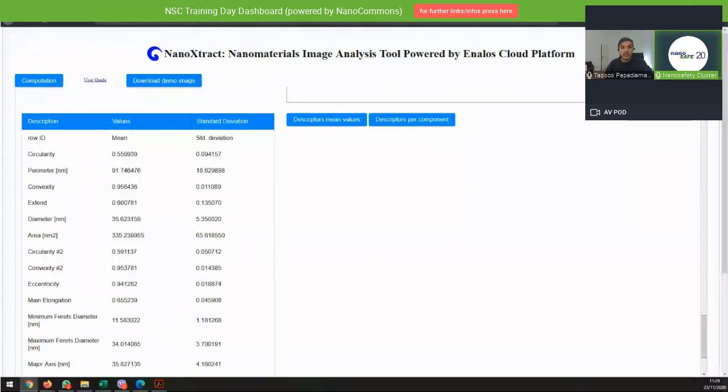We have, however, at the moment 3 example folders in our Google Drive, the shared folder. Each of them contains a couple of different images from titanium dioxide over nanoceria. Silica nanoparticles are there. This is, of course, really a jump into cold water, and we really appreciate having a volunteer like Tassos to try out something like that. But we can eventually look into some of the provided examples and give it a trial.